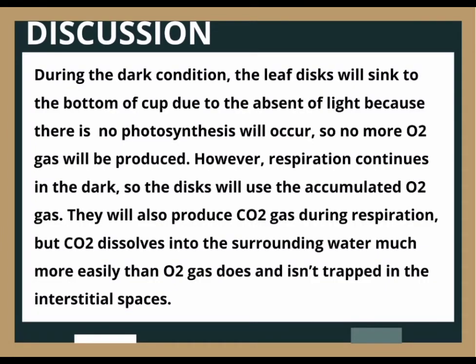Lastly, during the dark condition, the leaf disc will sink to the bottom of the cup due to the absence of light, because no photosynthesis will occur, so no more oxygen gas will be produced. However, respiration continues in the dark, so the discs will use the accumulated oxygen gas. They will also produce carbon dioxide gas during respiration, but carbon dioxide dissolves into the surrounding water much more easily than oxygen gas does and isn't trapped in the interstitial space.